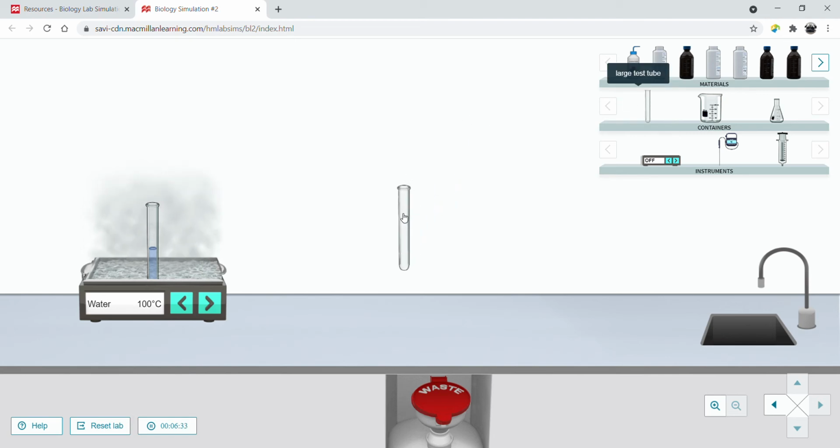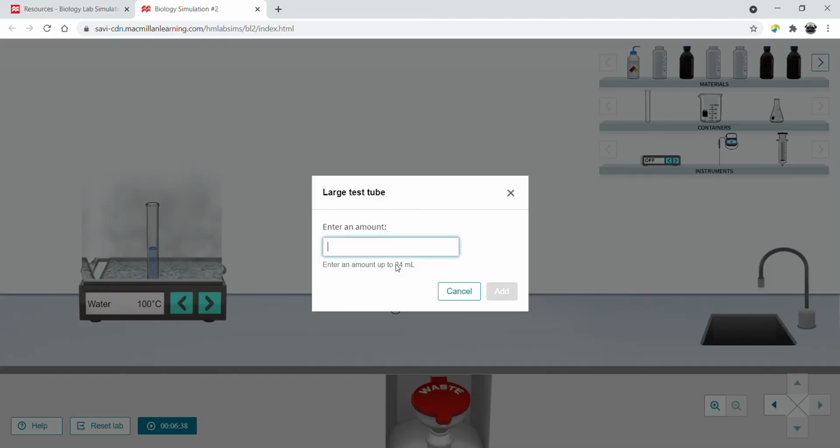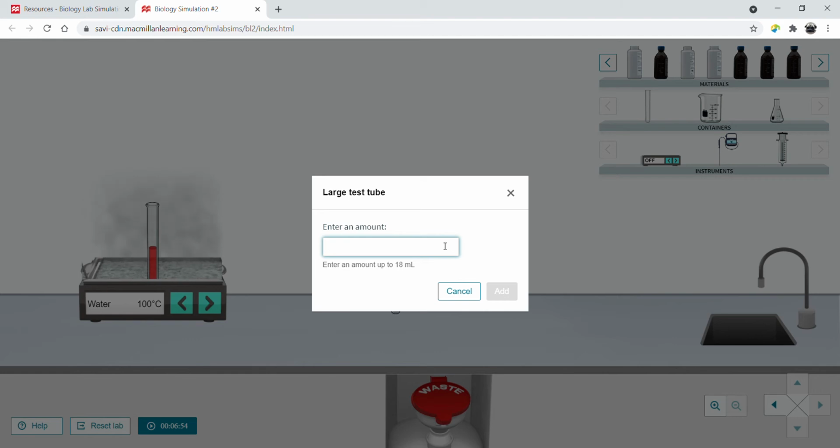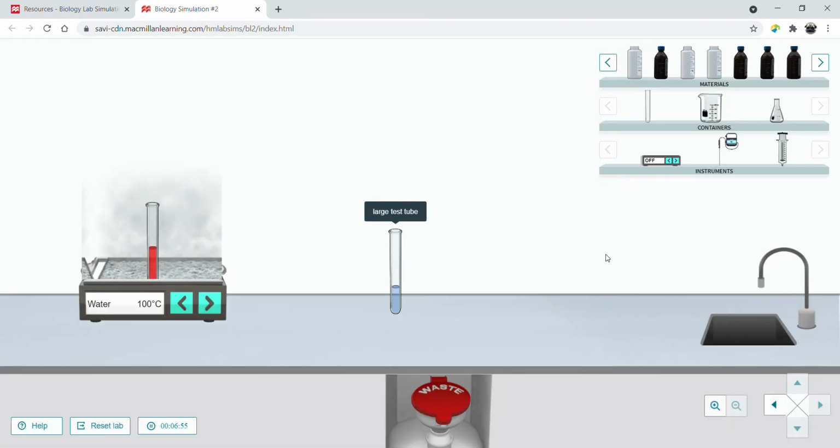And in the meantime, that's your positive control, that's your glucose solution. I'm going to get your water. Going to set up the next tube. Now record this on table 1. And get your Benedict solution. Benedict solution is right here. Okay. Did I just add 6 mLs of Benedict solution? You know what? I'm just going to add water to that because I just don't want to goof up.